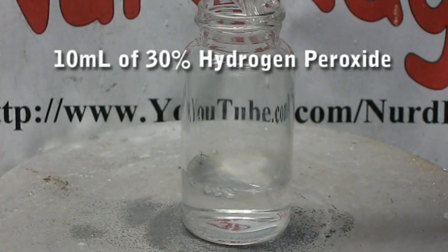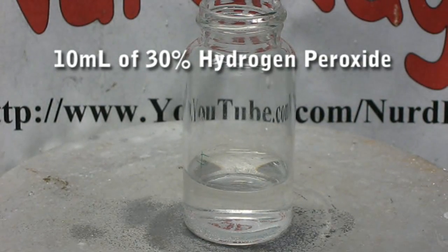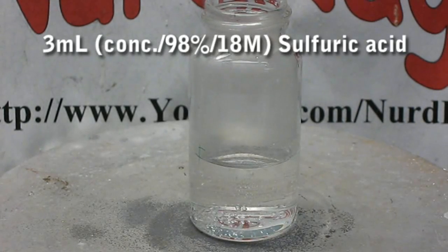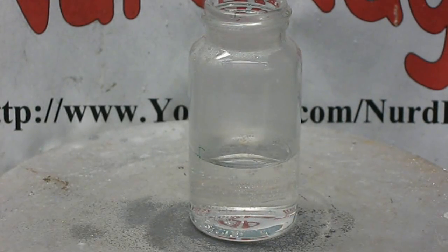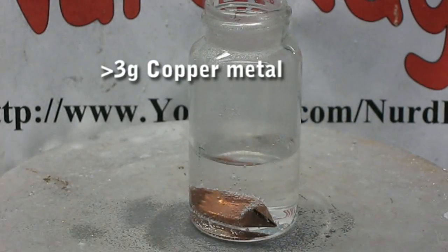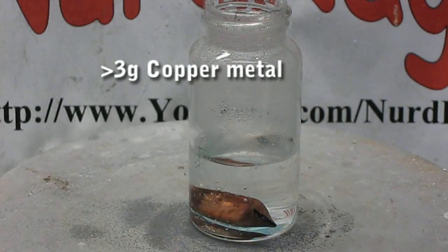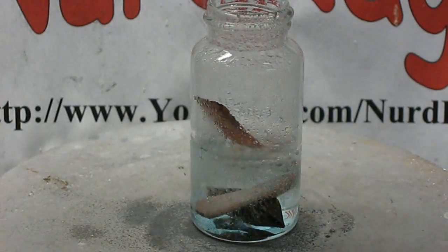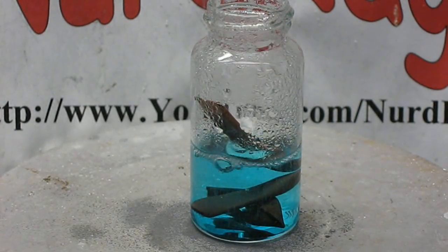In the first method, get a solution of 10 mL of 30% hydrogen peroxide and add 3 mL of concentrated sulfuric acid. It's going to heat up a lot so be very careful. Now drop in 3 grams or so of copper metal. This can be obtained from pipes or wires. The copper metal will dissolve to form copper sulfate.